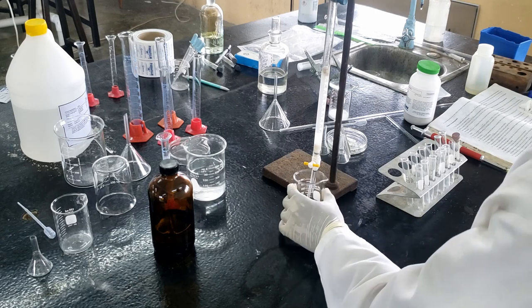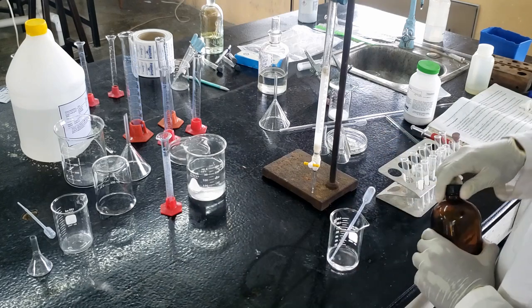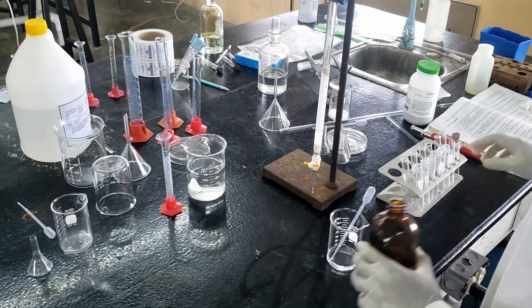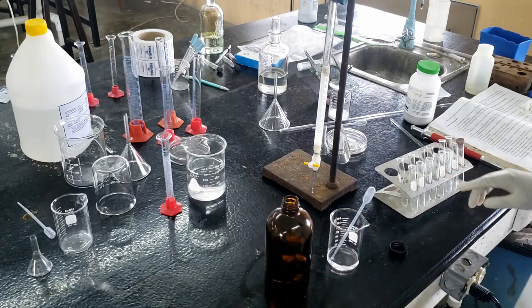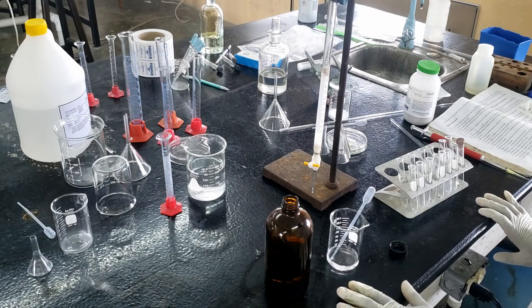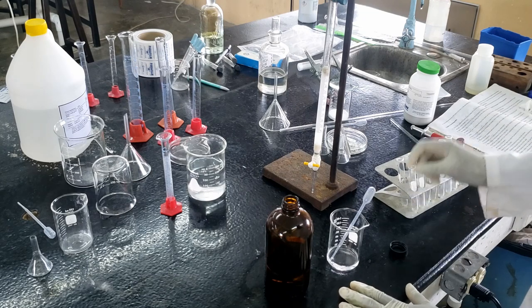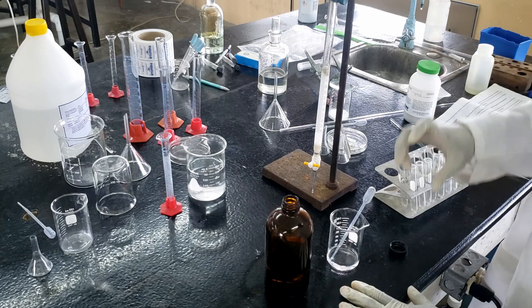we can now fill the burette up with some more eluent solution. And we're going to start collecting fractions in these small test tubes. So we'll collect fractions for about 5 to 8 mL. And then for every about five fractions, we're going to test to see if we've gotten any products.